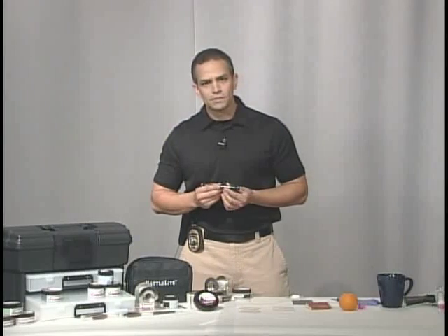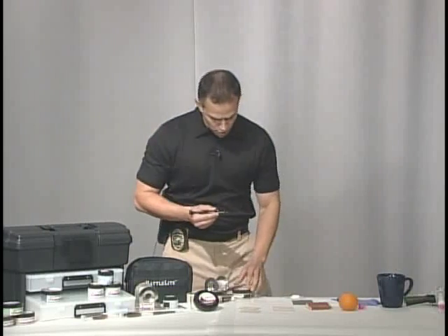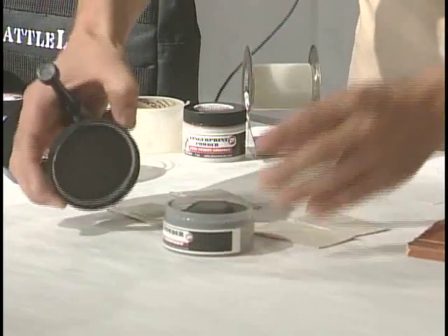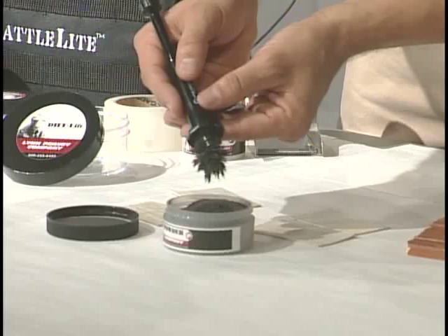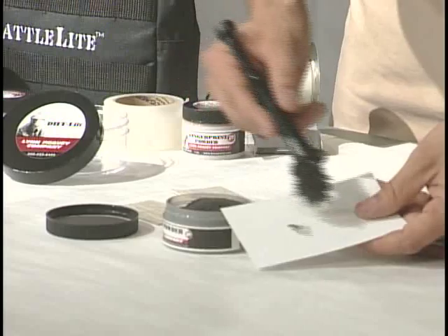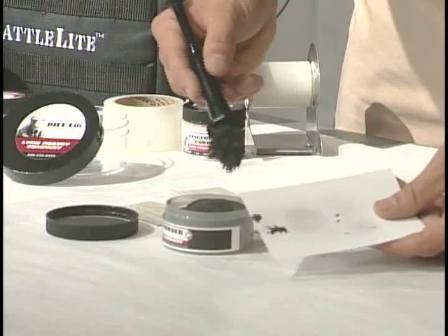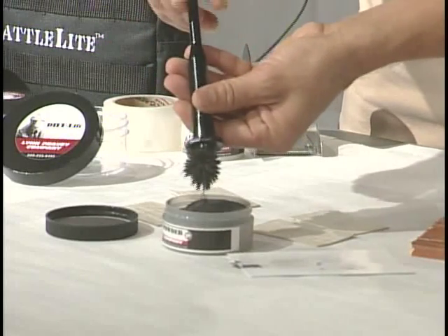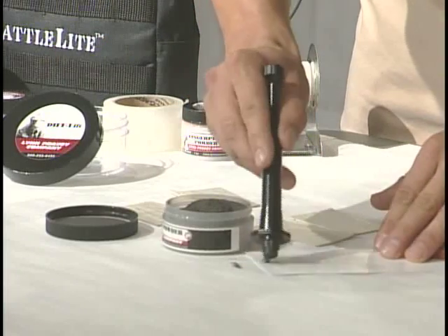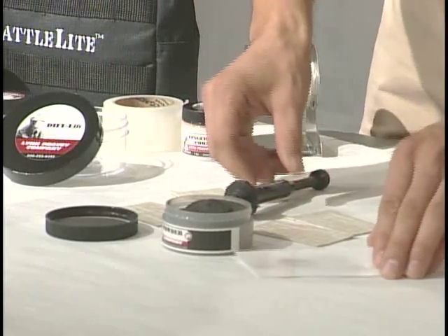Magnetic powder is applied with a magnetic brush. The magnetic brush has a magnet in the tip, and when brought towards the magnetic powder, it's going to attract the powder onto the tip of the brush. Then you would brush it on your evidence to develop your print. When you're done, you're going to pull the plunger to let the powder fall back into its receptacle, go back and clean up, and there you have your print.